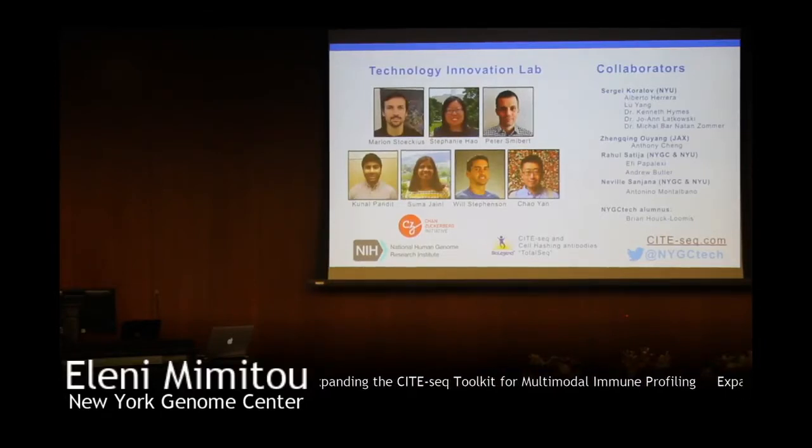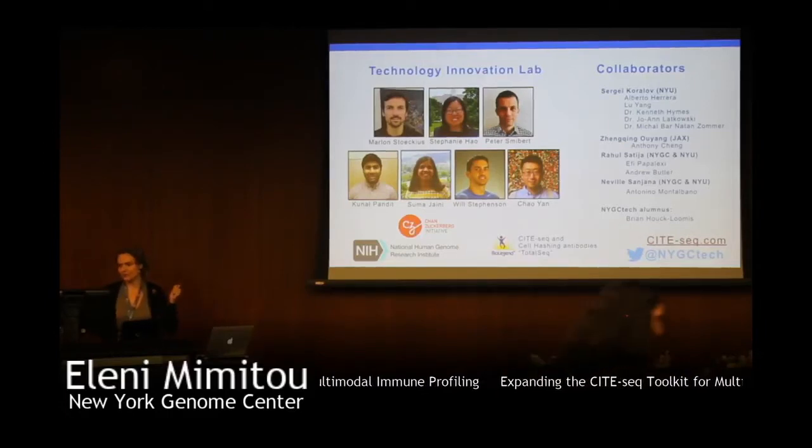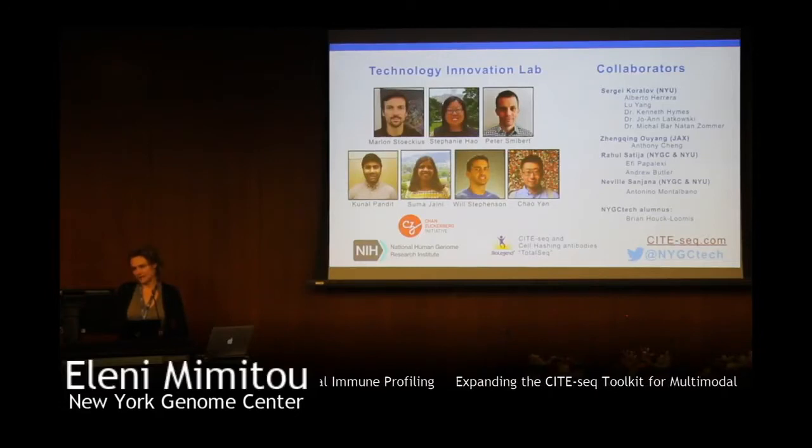So the proof of principle I presented was with non-targeting guides. I'm working now with a library that has targeting guides, and a collaboration we are currently working on in Rahul's lab also has targeting guides, but we never explored this. It's part of our plan to look at the mutation itself and the perturbation.